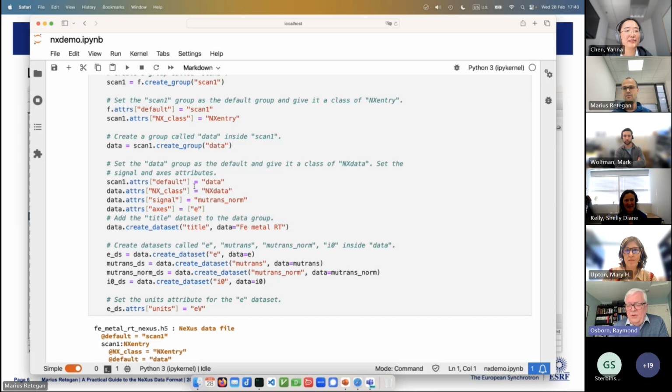Actually, perhaps I could quickly mention that one of the goals of the NeXus format was to make it easier for scientists to use NeXus. As developers, NeXus is getting increasing traction at facilities, but I think it's not so widely used by the scientists who get the data, because of the lack of intuitive tools for them to use. We're hoping to change that, and I hope that people can look into that and comment if they think there are other things needed. Okay, thank you.